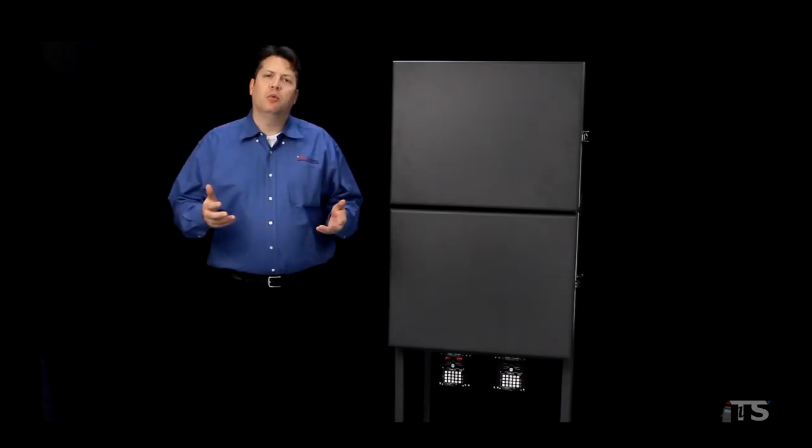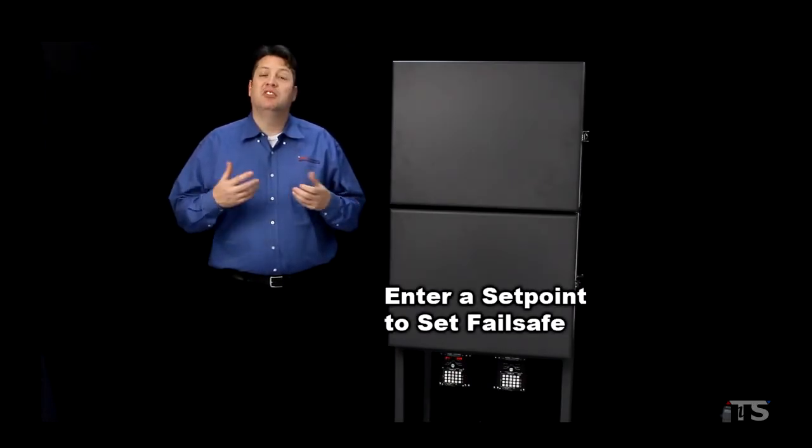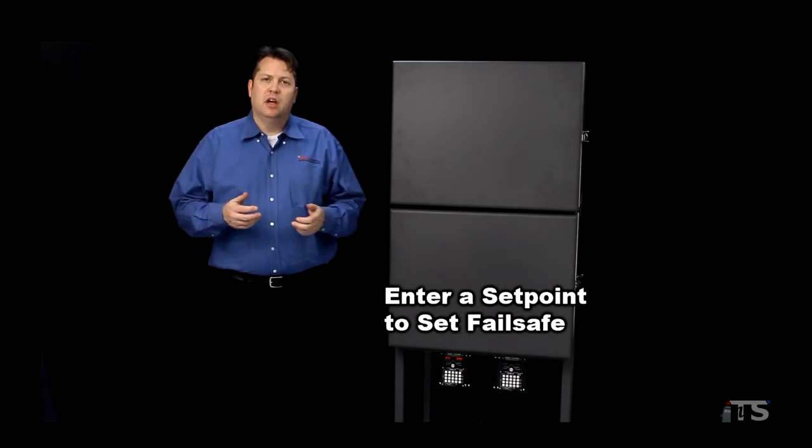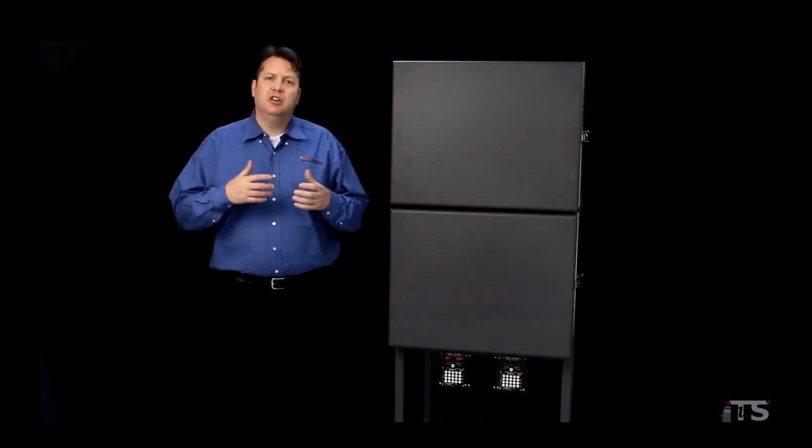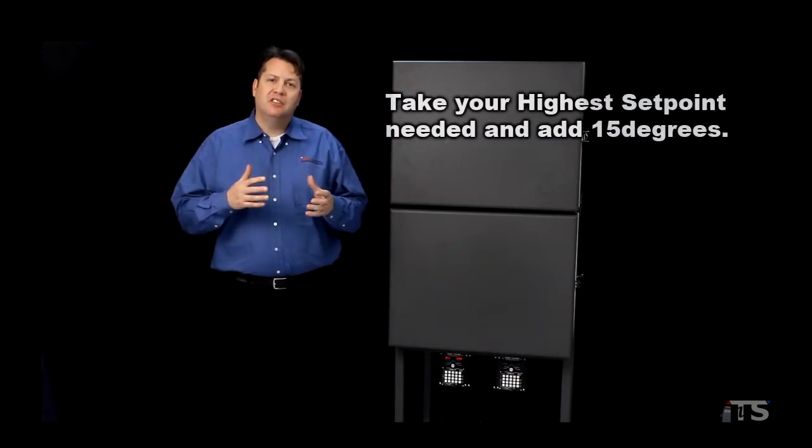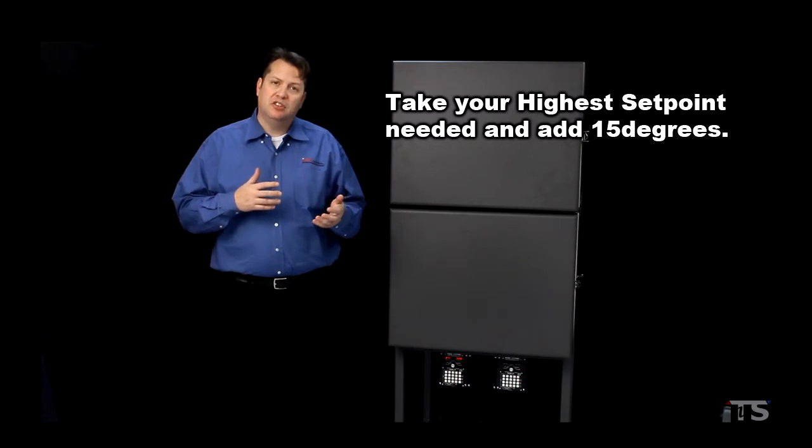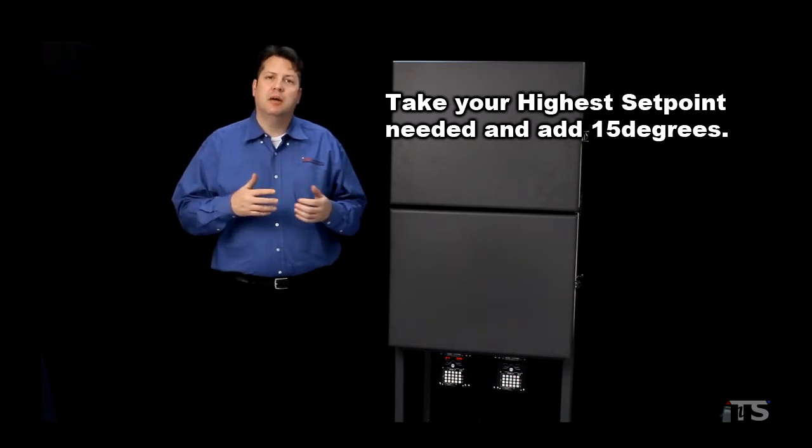At this point, we're going to need to enter in a setpoint temperature to be able to set the bimetal failsafe. A simple guideline is to take your highest setpoint temperature that you're going to use in your testing and add 15 degrees to that point.